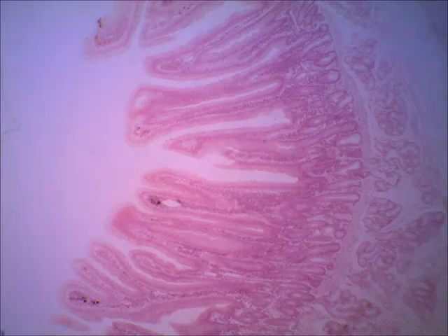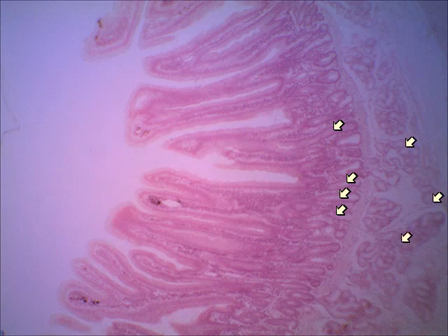juice. Here's another view. I believe this one will still be on scanning, but it just shows a different area. Here you easily can see the villi. Those are the finger-like projections into the lumen. I'm seeing right here, you see the crypts of Lieberkühn, and then in the submucosa, you see the Brunner's glands.